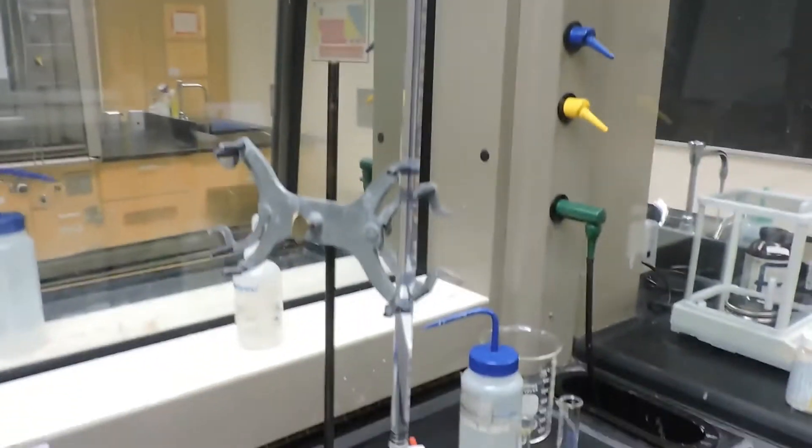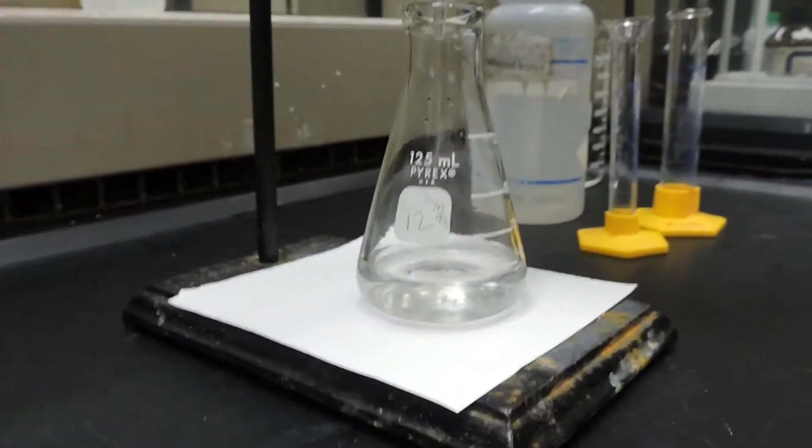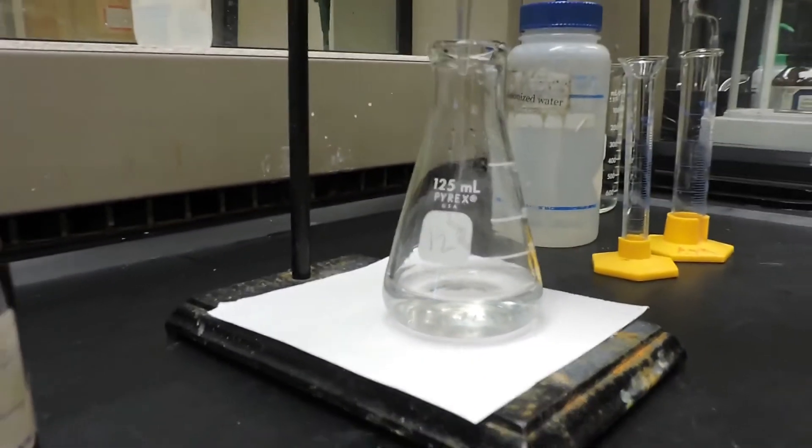Now we will slowly introduce the sodium hydroxide solution to our aspirin solution until the phenolphthalein indicator changes color.